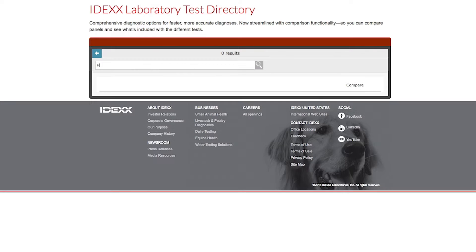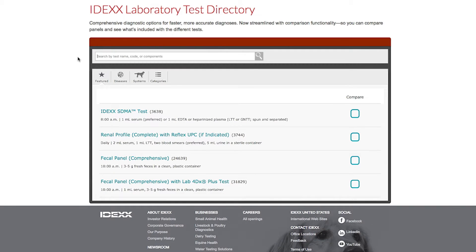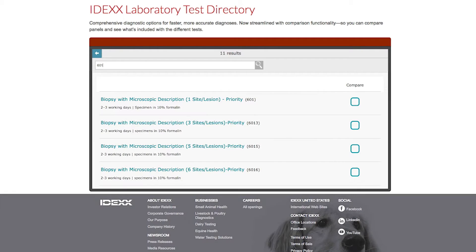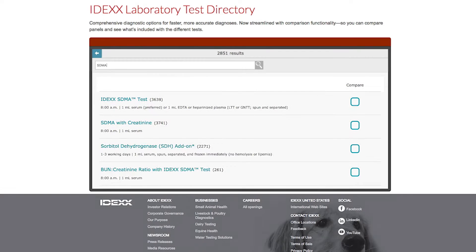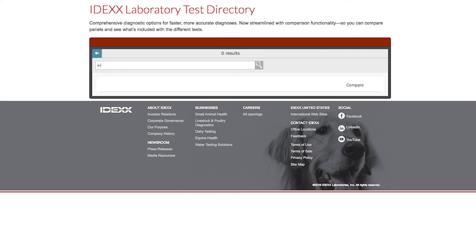You can search by test name, test code, test component such as SDMA, and even by synonym like antifreeze for the ethylene glycol test.